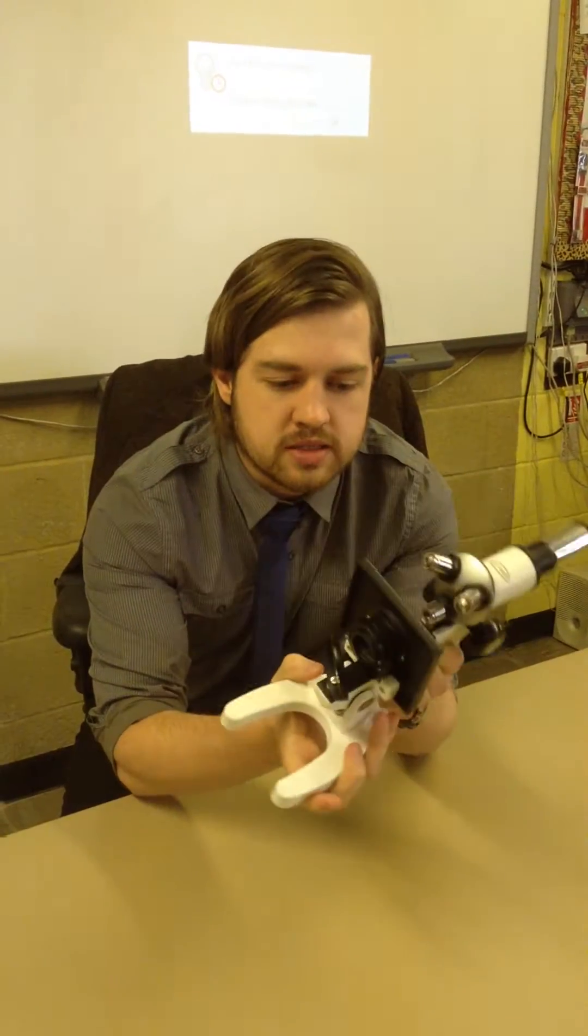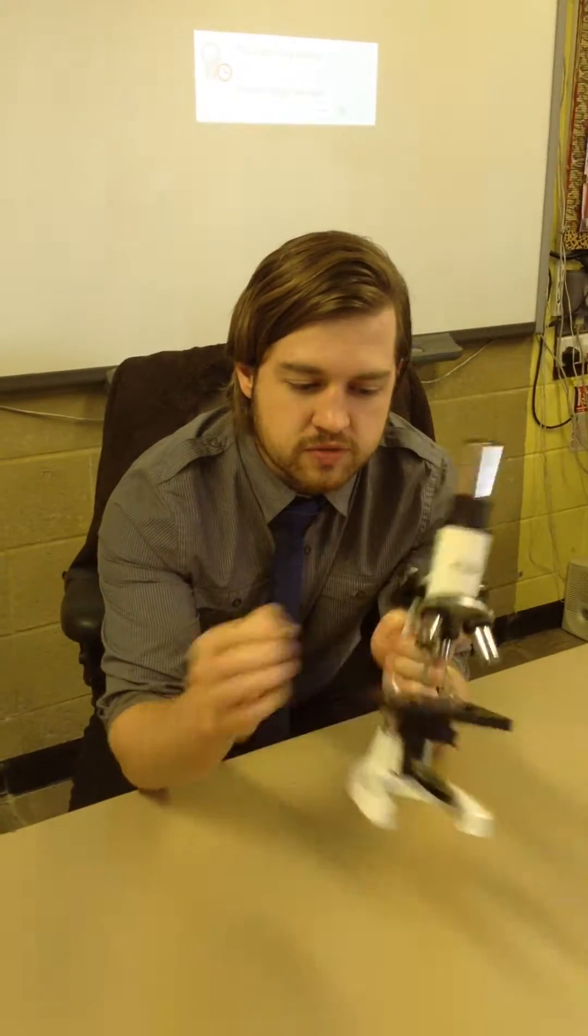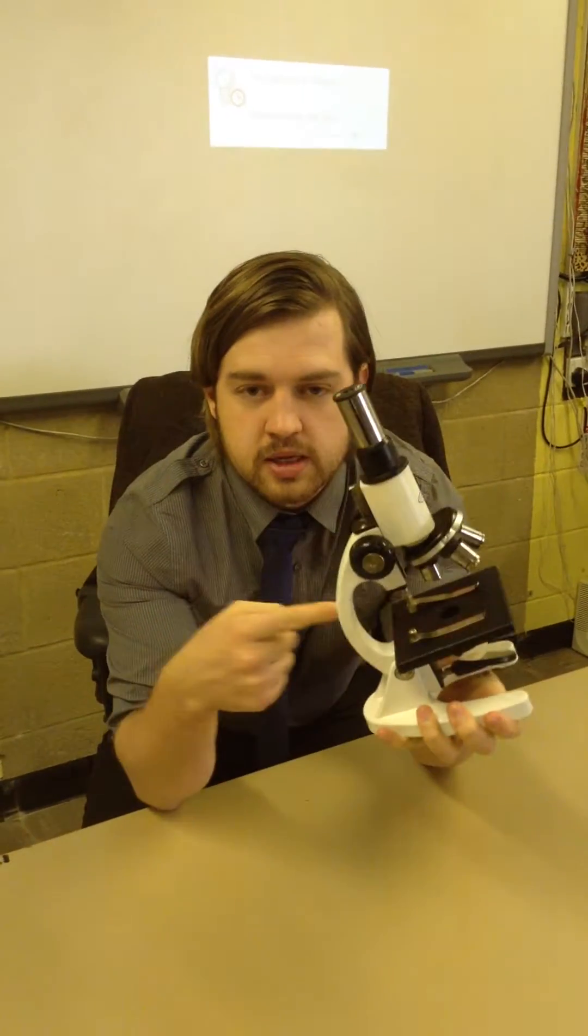Now, in order to use a microscope, you'll need to know exactly what all the different parts of the microscope are. So if I start, first of all, with the arm of the microscope, that's this part here.